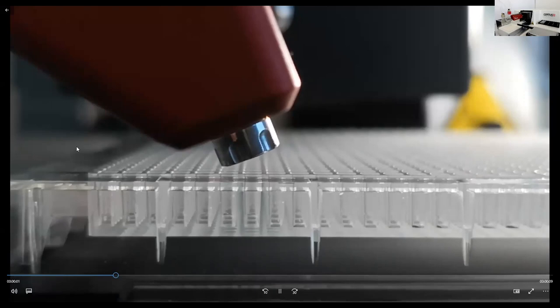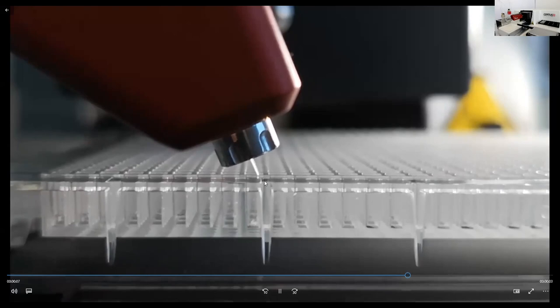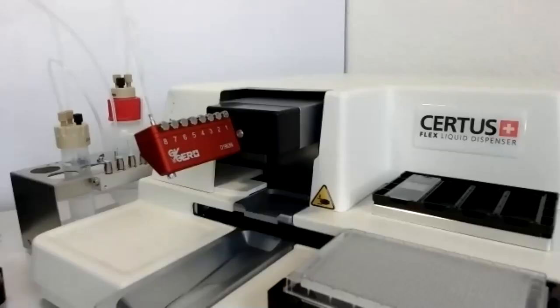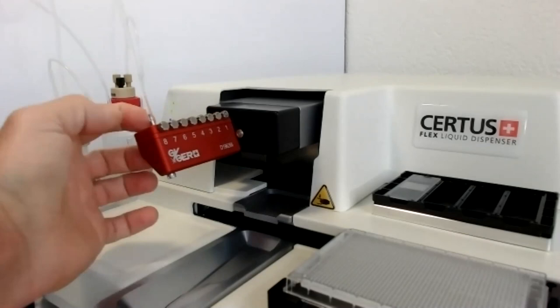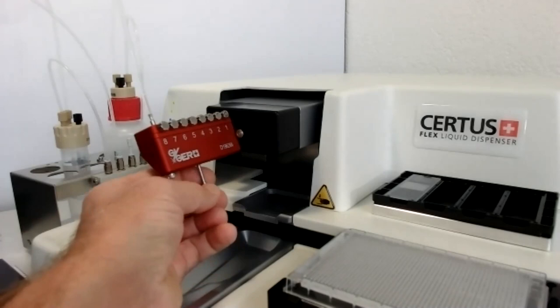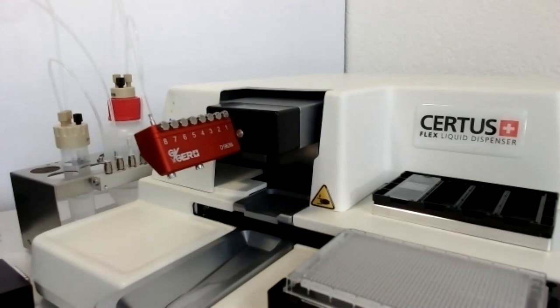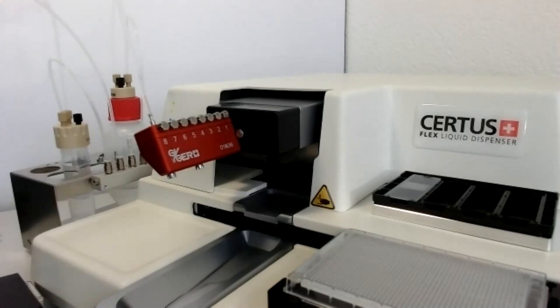Here you go. As you can see, the jet is hitting the well at the wall, and the fluid goes gently to the bottom. As I told you before, same as the straight head, you can configure all those 8 channels with different valve types. You can use syringes or tubings coming out of bottles to create your complex protocols. That was just a short overview of the possibilities of straight head, angled head, dispensing into different plate formats. And yes, Sarah, by the way, are there already pending questions?